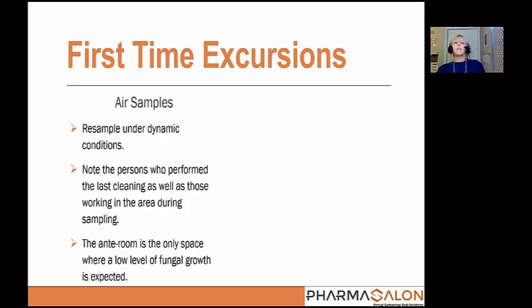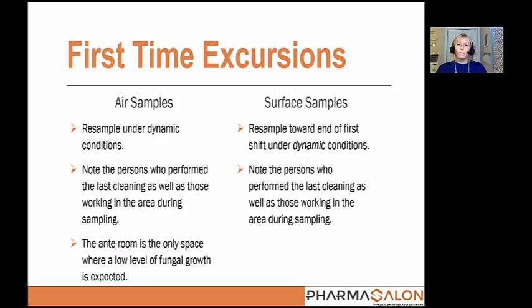All right, so that was a long answer to the one CFU of mold in the ante-room, but do you have to react to it based on the current chapter? Yes, but it's not the end of the world.